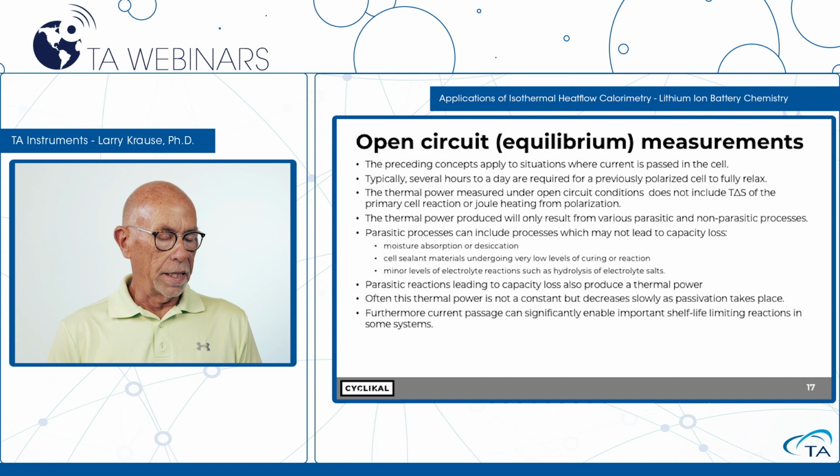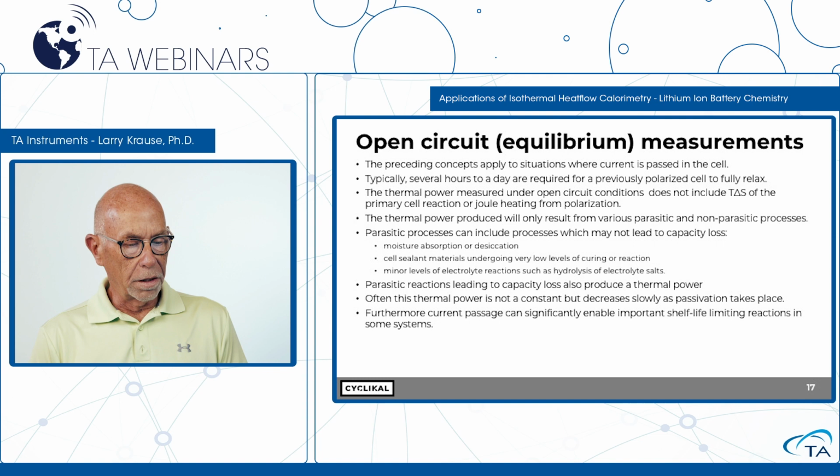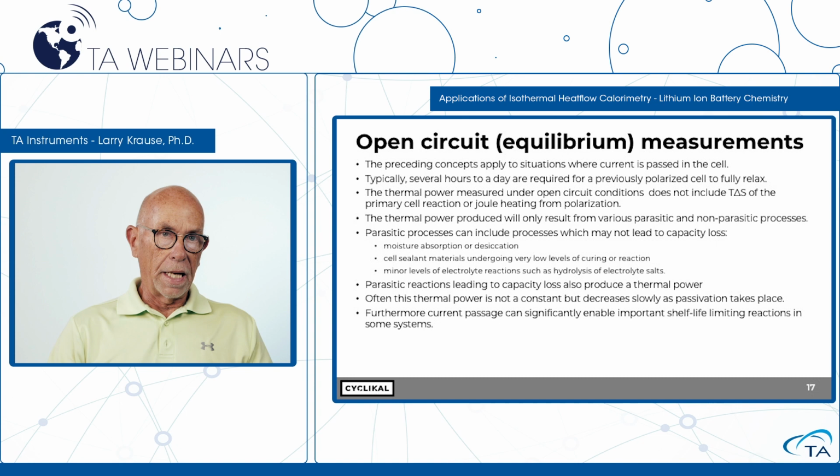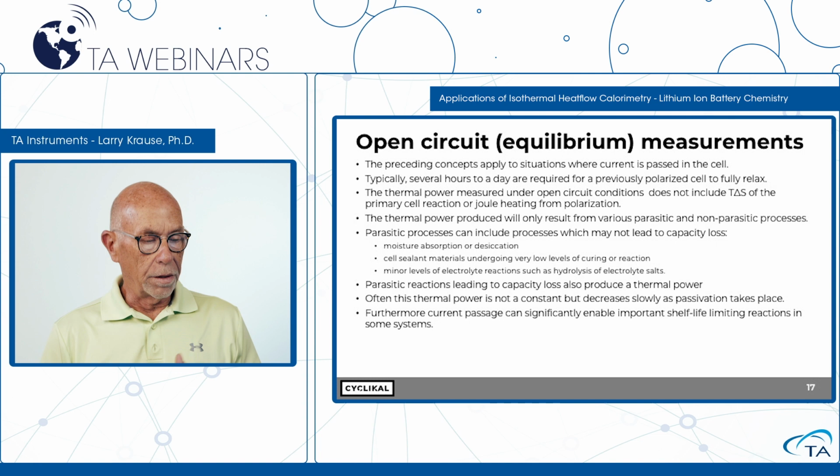The thermal power measured under open circuit conditions, so you're measuring an open circuit heat flow right now, that thermal power you measure does not include T delta S, and it does not include the heat from polarization. Thermal power produced in an open circuit measurement is just from the various parasitic and non-parasitic processes.